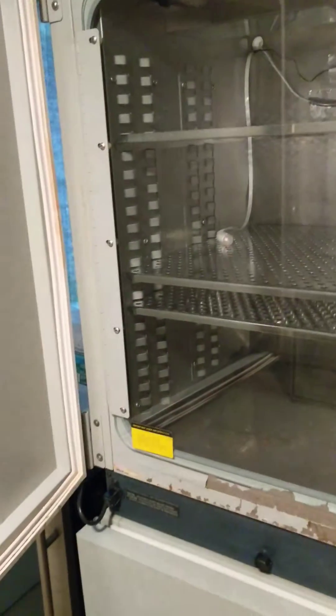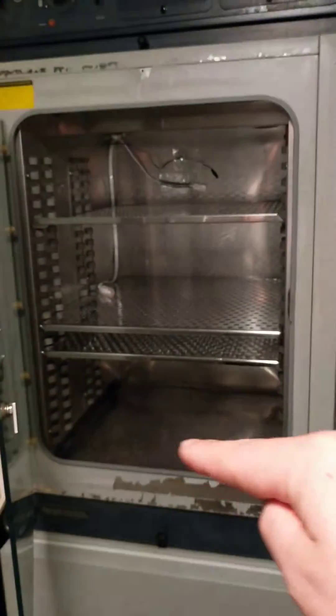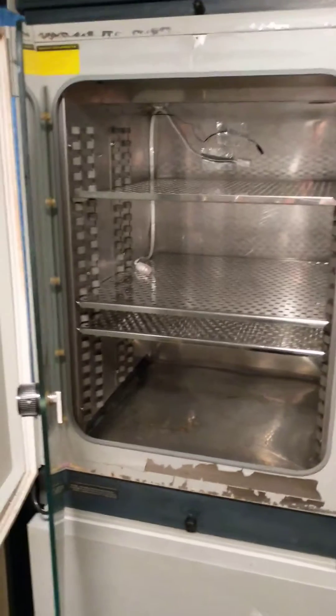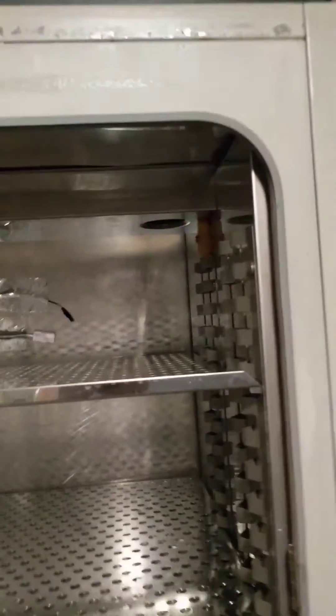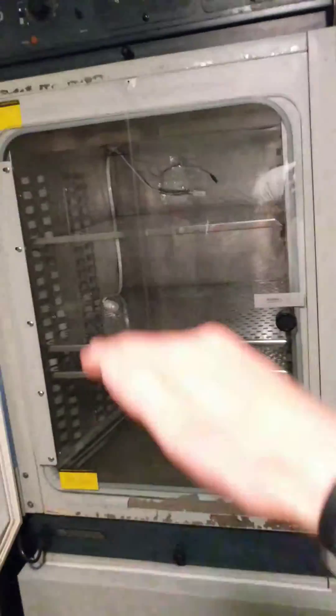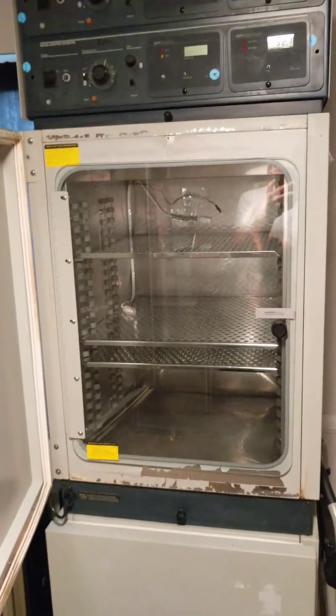All of these doors are actually heated as well — they have an electrical connector down at the bottom. There's a clear glass door on the inside that goes into the incubator, and then you have your normal shelving. This entire area is one single stainless steel seam-welded chamber, all self-contained. It also has a circulating fan on top that circulates air through these areas and back out the bottom and through the other side, constantly circulating the air to keep temperature ranges inside the chamber very consistent.